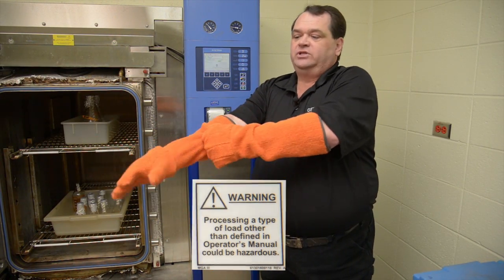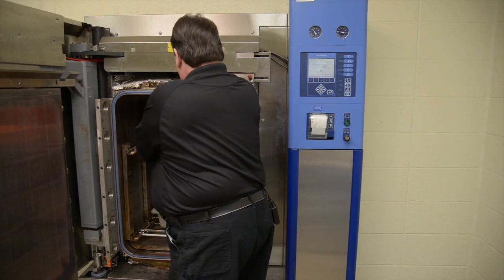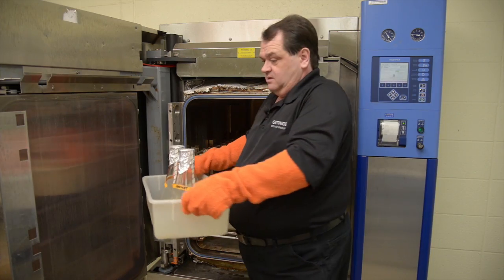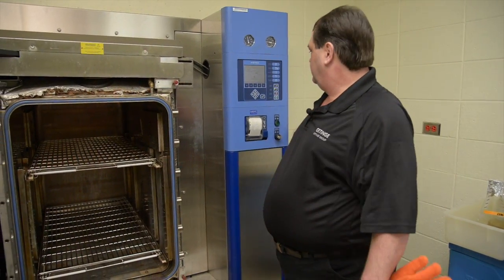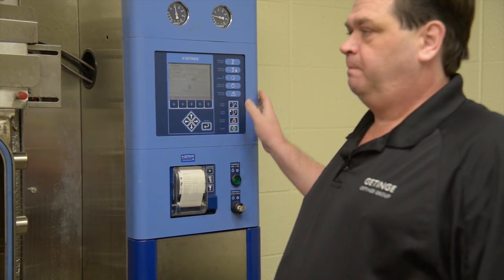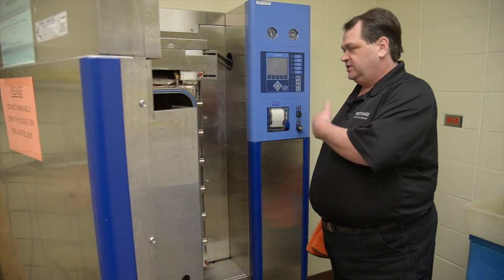The load has just been exposed to temperatures of around 250 degrees Fahrenheit or 121 degrees Celsius. Once the load is removed you can take off your gloves and close the door by pressing the door close button.